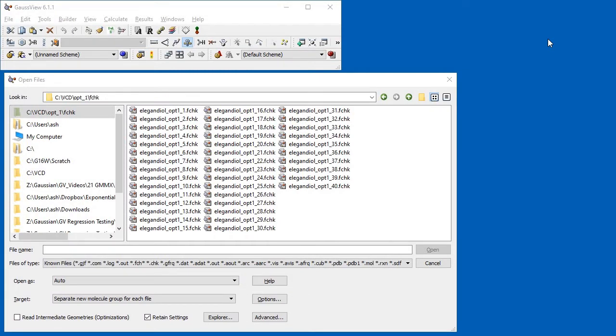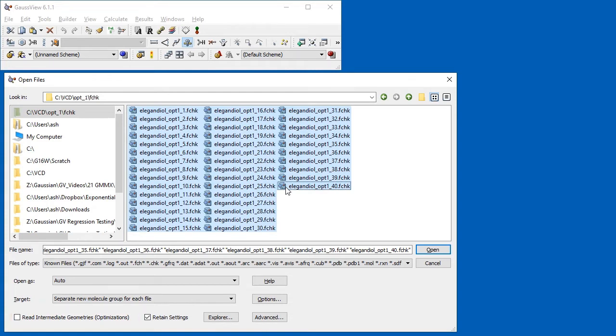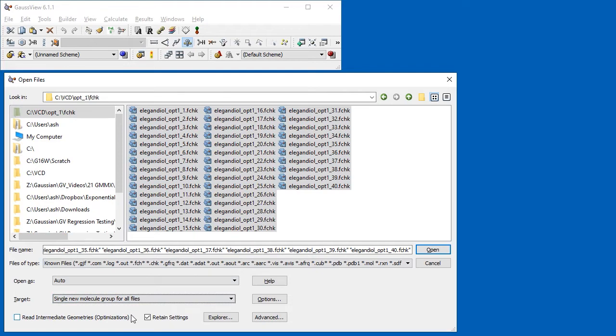Most of the optimizations run smoothly, but a few require the Calc=FC option to reach a stationary point. When all of the jobs have finished, we open all of their formatted checkpoint files at once, ensuring that Read Intermediate Geometries is not selected, and that a single new molecule group for all files is the target.